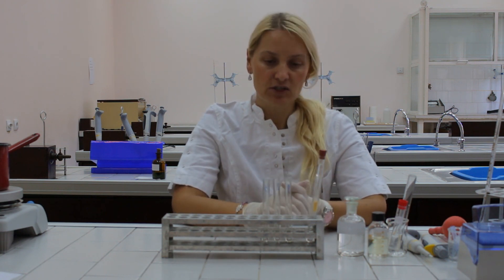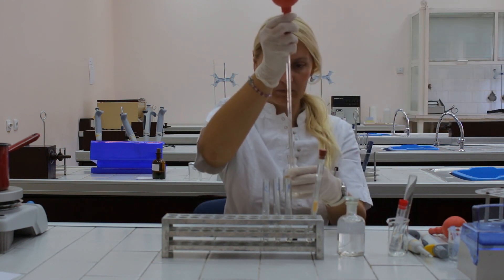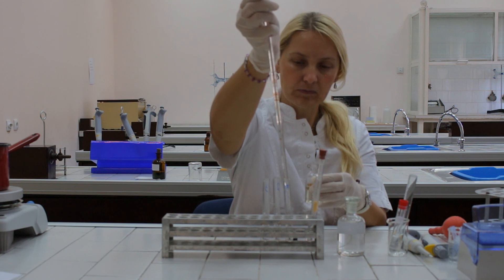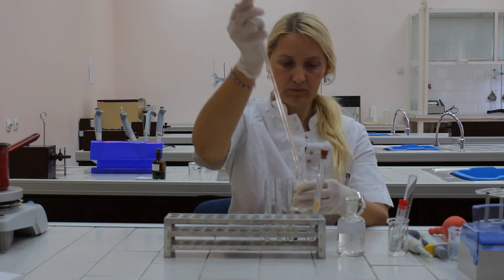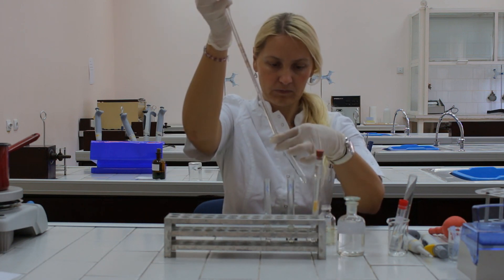To prove the presence of amino acids in these three test tubes, we should pipet one and a half milliliters of ninhydrin reagent into each test tube. Put a stopper on each test tube.